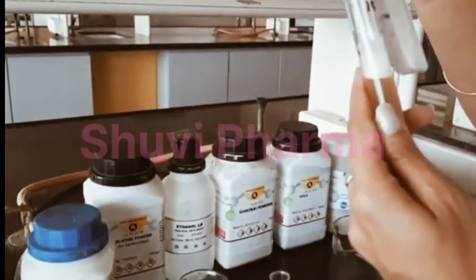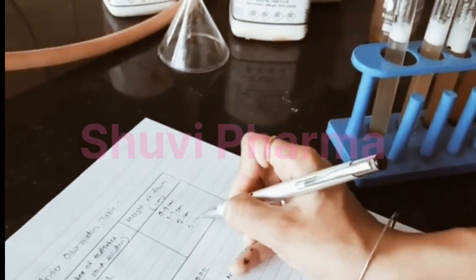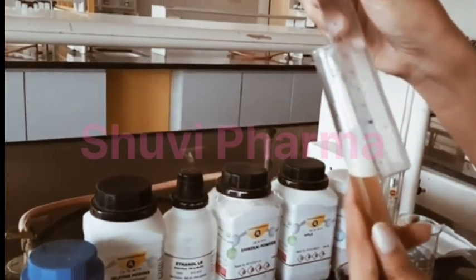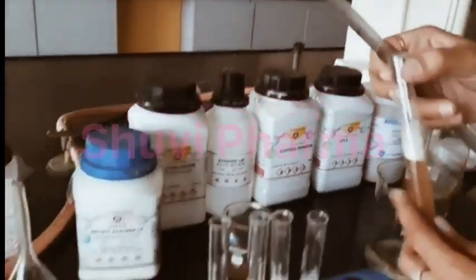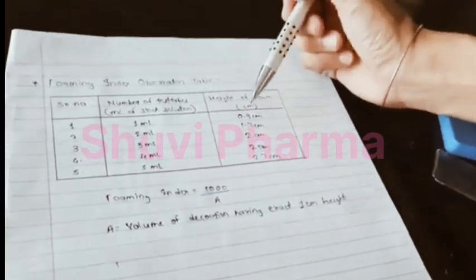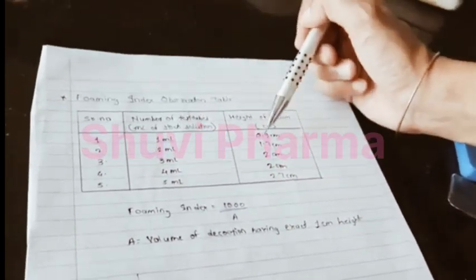For the fourth test tube, it is also 2 centimeter. And for the fifth, it is 2.7 centimeter. So now here you can see 1 ml of test tube contains 0.9 centimeter, 2 ml contains 1.7.